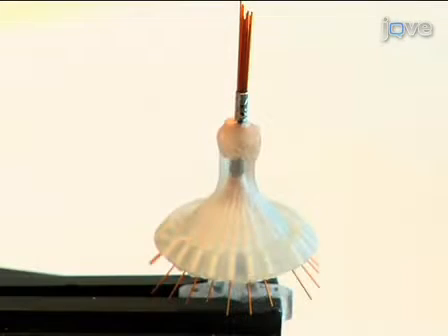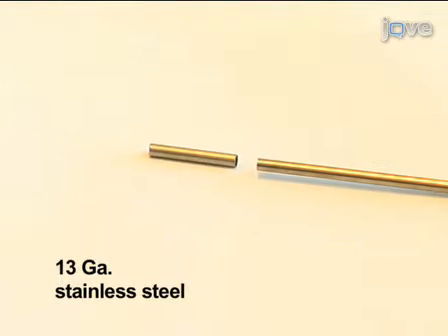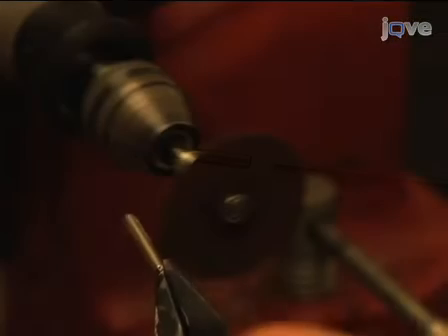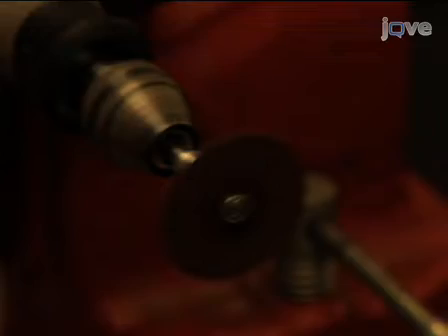The electrodes are guided toward a single site at the bottom of the drive by a number of electroguide tubes. First, we need to make the collector cannula that will hold all the electroguide tubes. The collector cannula is made from a 1.5 cm long piece of stainless steel tube. The collector cannula will be held in with dental cement, so to enhance adhesion, carefully roughen the tube using a Dremel grinding wheel.